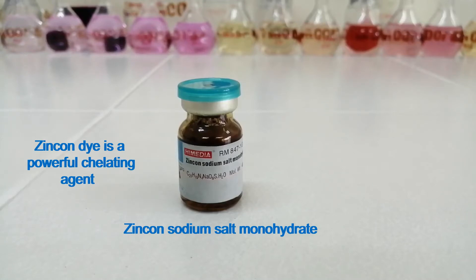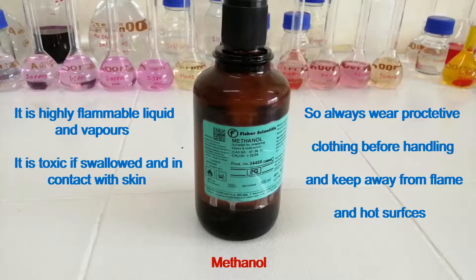Zincone dye is a powerful chelating agent. This is methanol. It is a highly flammable liquid, and it is toxic if swallowed and in contact with skin. So always wear protective clothing before handling and keep away from flame and hot surfaces.